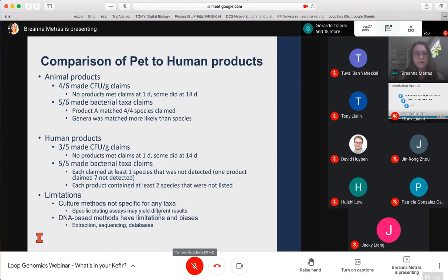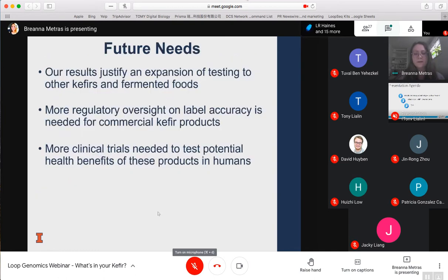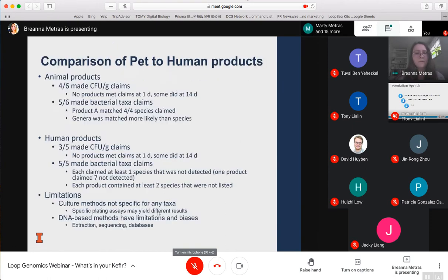If the genera match, it's not as relevant as if the species are matching. For the human products, only 3 of 5 of them listed CFU per gram claims, and not one of them met them at day 1, although some did again at day 14. And 5 out of 5 of them made bacterial claims, and all of them claimed at least 1 species that was not detected, and one of them claimed up to 7 that was not detected. And each product contained at least 2 species that were not listed by the ingredients.